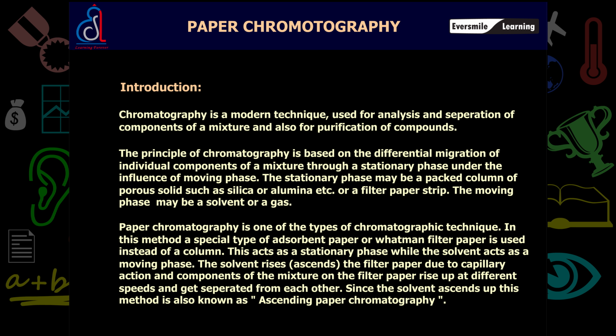The solvent rises, that is, ascends the filter paper due to capillary action, and components of the mixture on the filter paper rise up at different speeds and get separated from each other. Since the solvent ascends up, this method is also known as ascending paper chromatography.